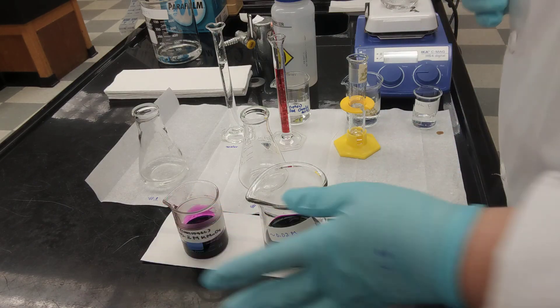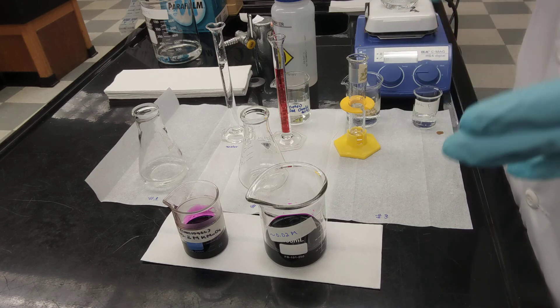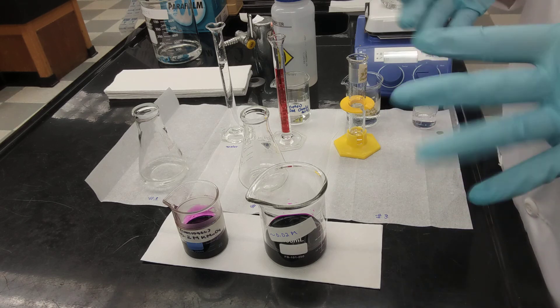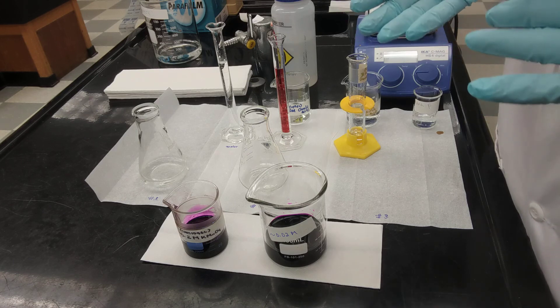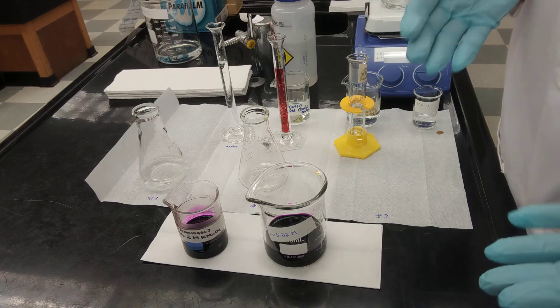So if you take 10 milliliters from your potassium permanganate and add 90 milliliters of distilled water, your total volume is 100 milliliters and you will have a solution with a concentration close to 0.02 molar. I'm using graduated cylinders to measure those volumes. We're preparing a solution of approximately 0.02 molar, but the first thing we're doing in this experiment is actually performing a titration to determine the exact concentration of your potassium permanganate solution.